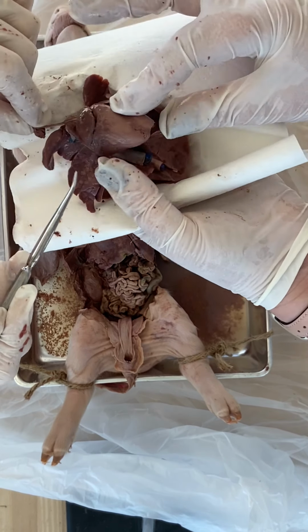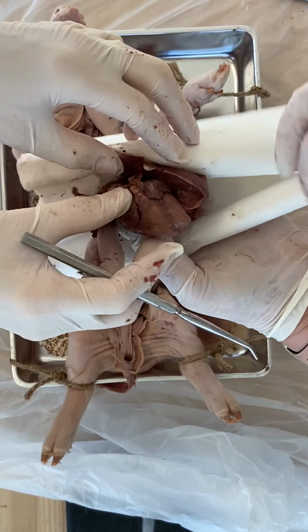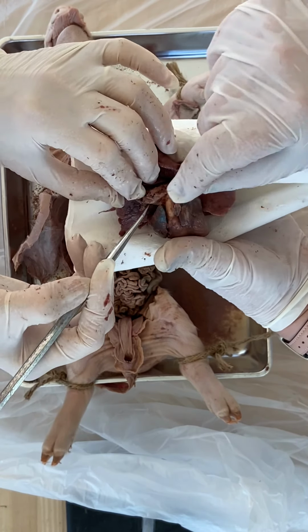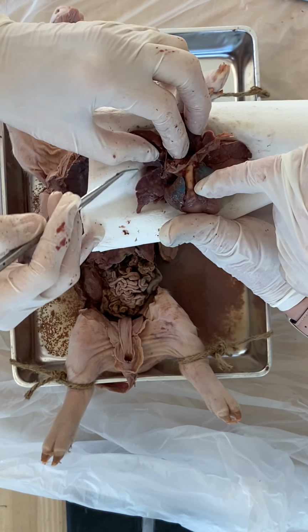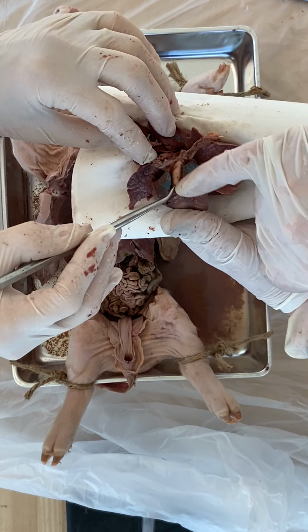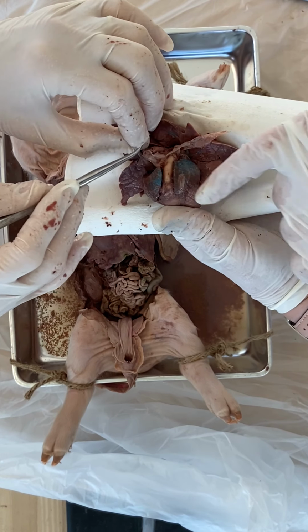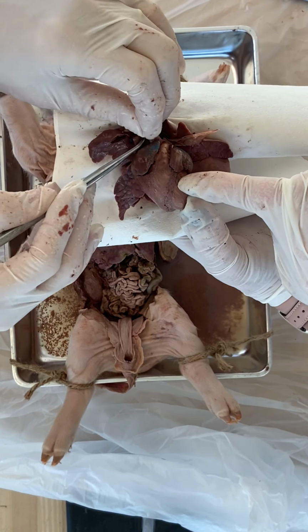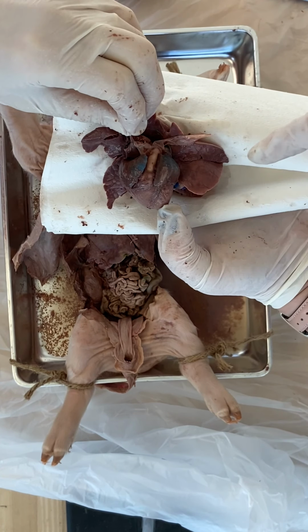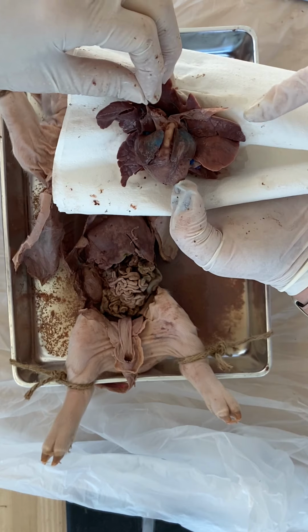Gosh, it is hard, isn't it? So here's your pulmonary artery. Do you see the aorta coming? So this one here is the pulmonary artery. This is the main one. The one goes up the middle, and then it splits into left and right. So pulmonary artery coming from the right ventricle, taking blood to the lungs.